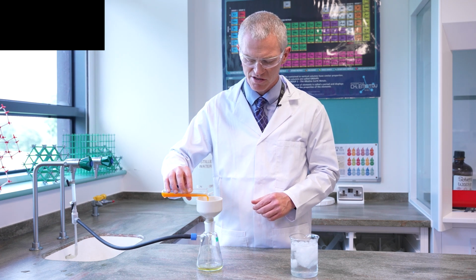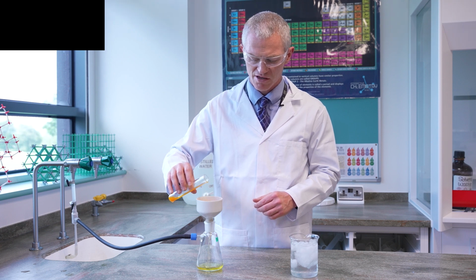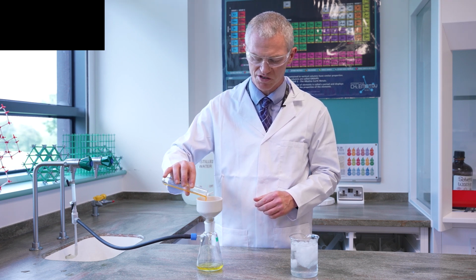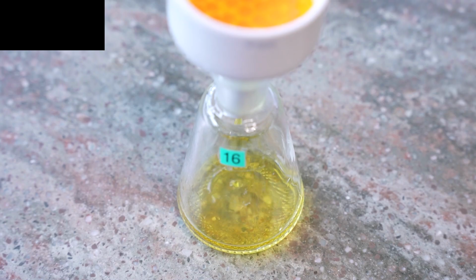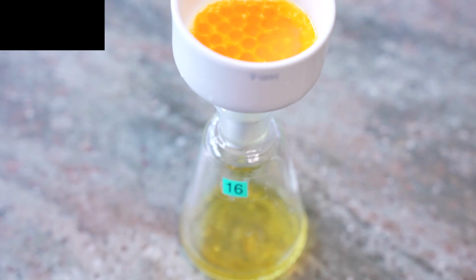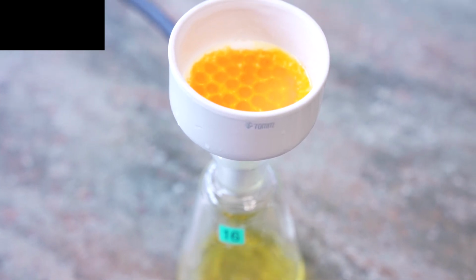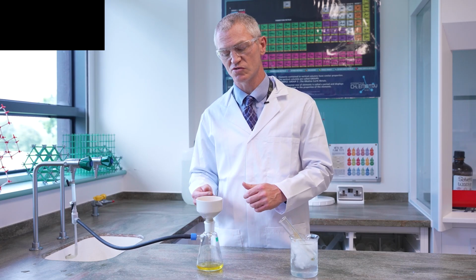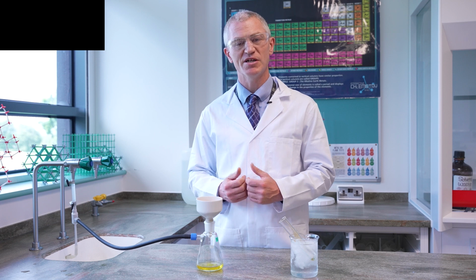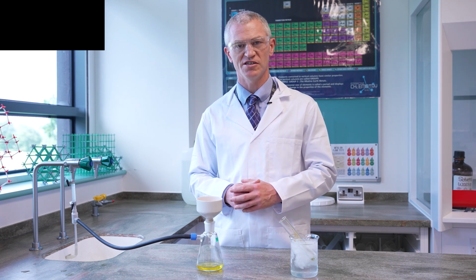What should happen is it will be sucked through by the vacuum, and you will start to get your orange precipitate which will form on the paper. All you have to do once you have filtered this is leave it to dry for a day or so, usually in the fume cupboard at your school, and then you can perform a melting point analysis to identify what the actual ketone was in the first place.